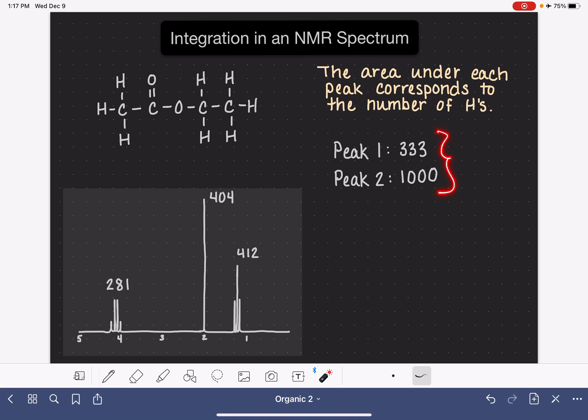These integrals are telling us that peak number one has an area of 333, and peak number two has an area of 1000. This is like the ratio of the size of peak number one to peak number two, and also a ratio of the number of hydrogen atoms in peak number one relative to peak number two. The way that we analyze this integral data is by taking these numbers and turning them into numbers that are more reasonable for a molecule. Our first step is to look at all the numbers in our integrals, decide which one is the smallest numerically, and divide everything by that small number.